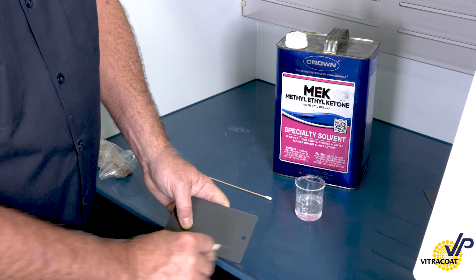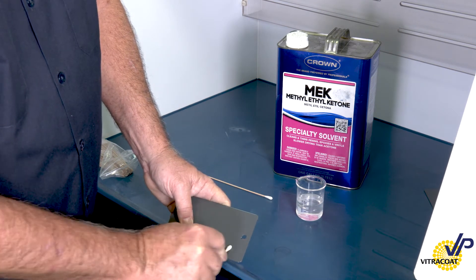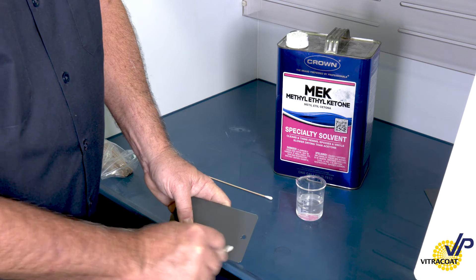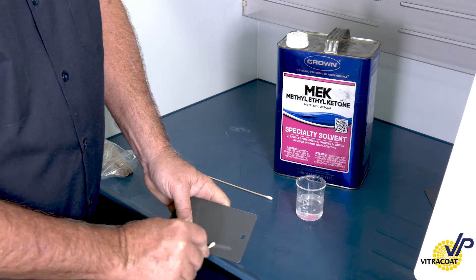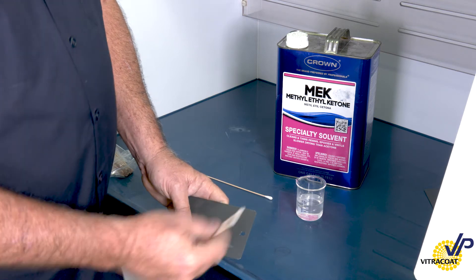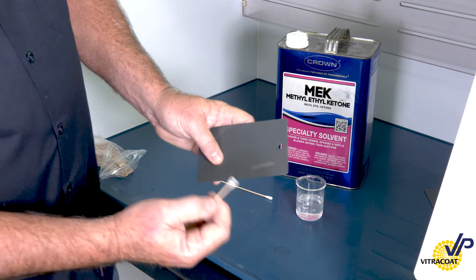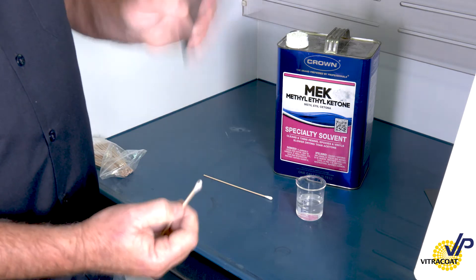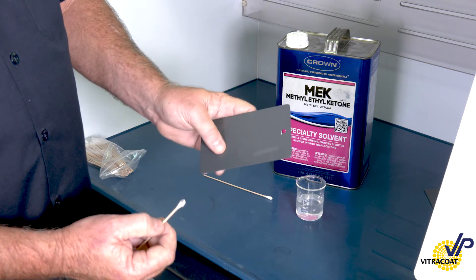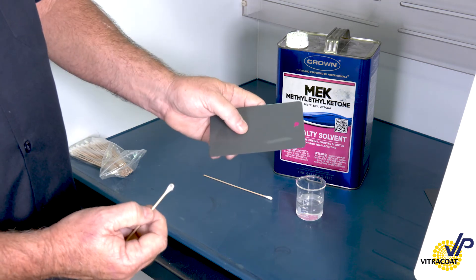One rub, two... So as you can see, we've got some discoloration in the material and we've got some pigment lift. This product is the known cure, and this is how this particular product shall respond when fully cured with MEK.